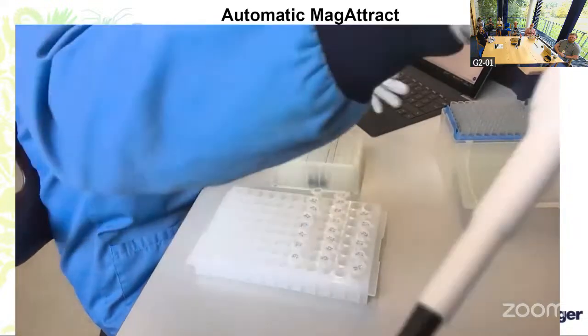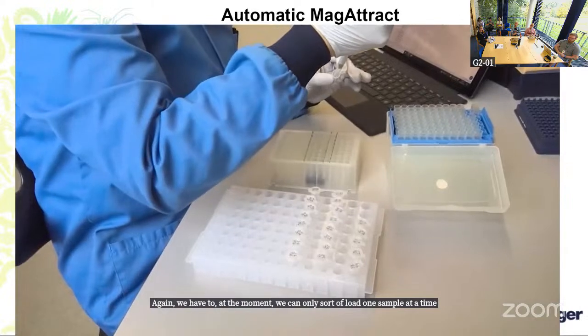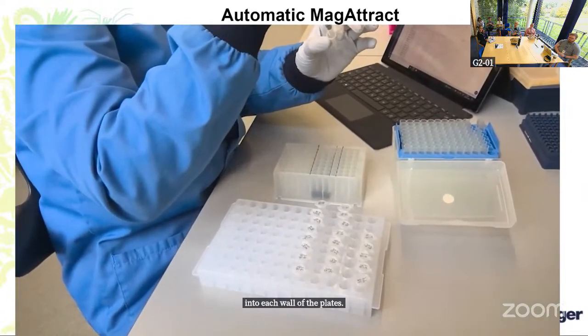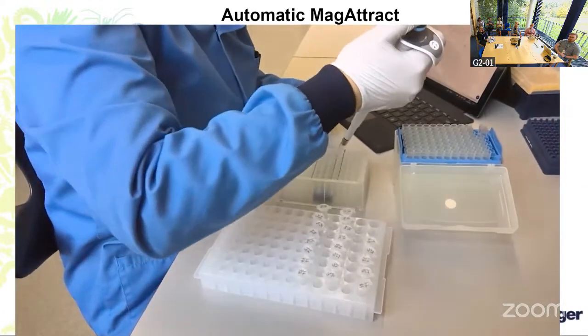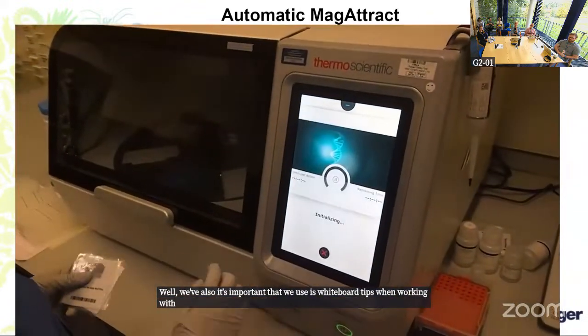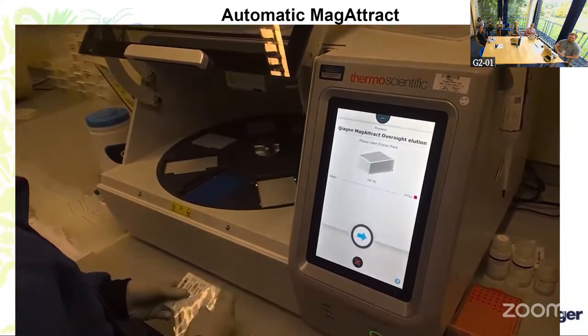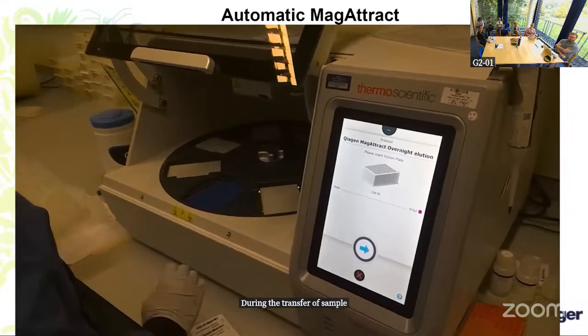At the moment, we can only load one sample at a time into each well of the plate. What is also important is that we use wide bore tips when working with DNA, so that we don't have any shearing during the transfer of sample into the plate.